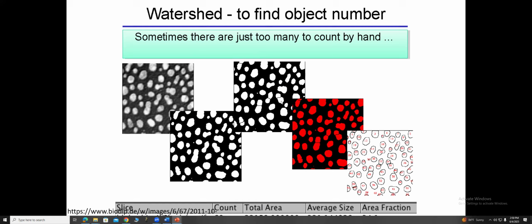This guy as well, right? So it actually put a split there, and now it can detect it as two different cells, right? So here is one cell, here's the other cell. So it actually can see that it's two cells.